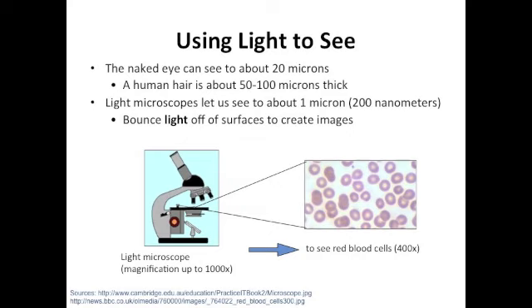Optical microscopes can be further subdivided into several categories. You've got the compound microscopes, which we're going to be using today. These are 2 lens systems. You've got the objective and the ocular eyepiece with a maximum magnification of about 1000x. Then you've got the stereo microscope, which is also called a dissecting microscope. These microscopes magnify up to about 100x, and they supply a 3-dimensional view of a specimen. They're used for observing opaque objects, things that are not transparent, just like you're learning in English class.